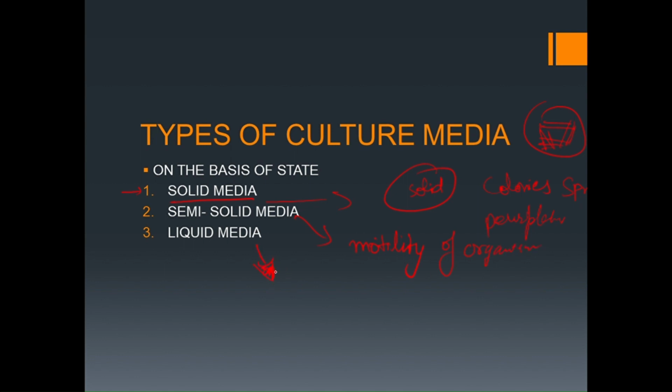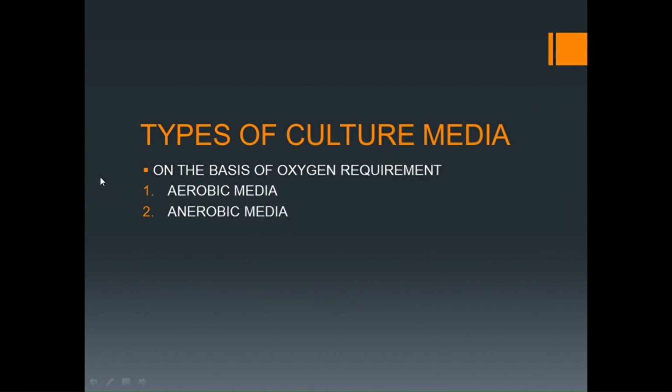The colonies grow in the liquid media in the form of turbidity, and this liquid media does not contain agar because agar solidifies the media. Semi-solid contains agar but in small quantity, let us say 0.5 to 0.8%, and solid media contains up to 2% of agar.